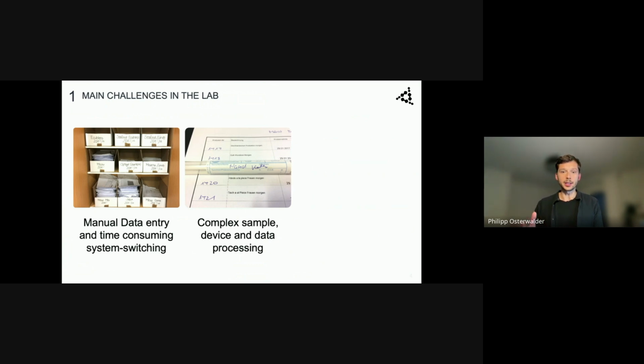Maybe then it's time to stop, assess and analyze the status quo, the current state, evaluate first, and then decide what the best next step will be, maybe to get rid of some redundant tools and implement one bigger tool, which has a lot more functionality and is more easily adaptable to the internal processes. But more information about this in the next step.